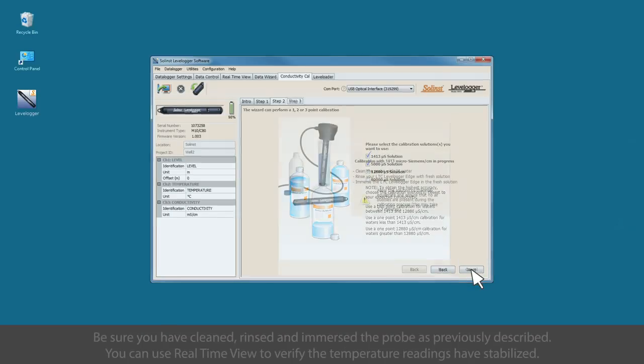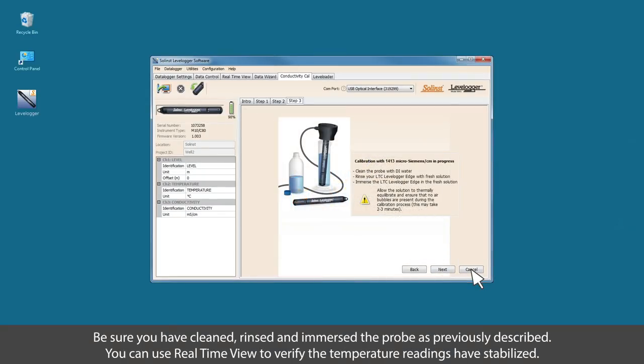Be sure you have cleaned, rinsed, and immersed the probe as previously described, and click next to calibrate.